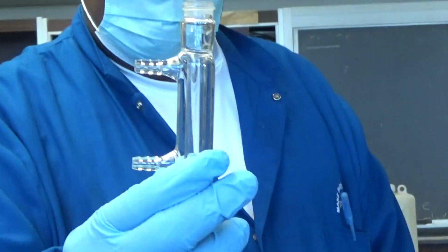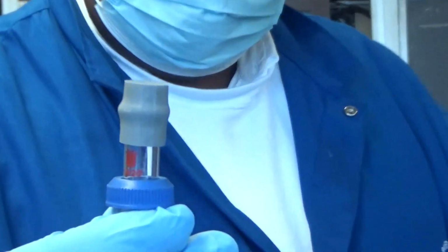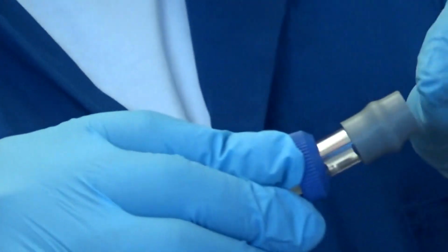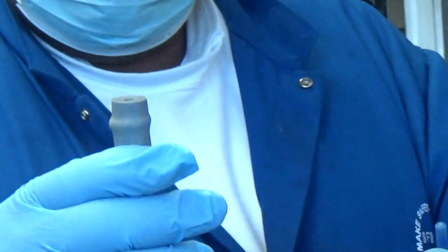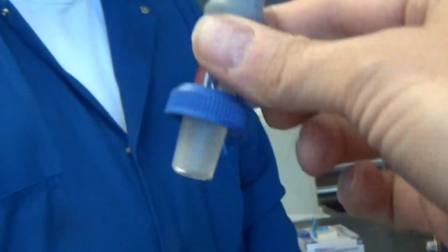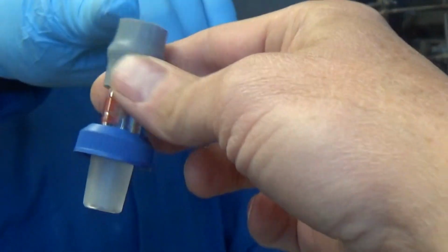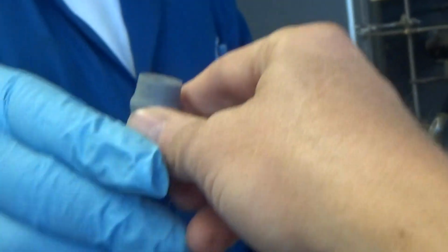We need a condenser. That's what is called a thermometer adapter. It's a rubber septum with a hole on the top, so you can put the thermometer through the septum, and then you can monitor the temperature underneath.